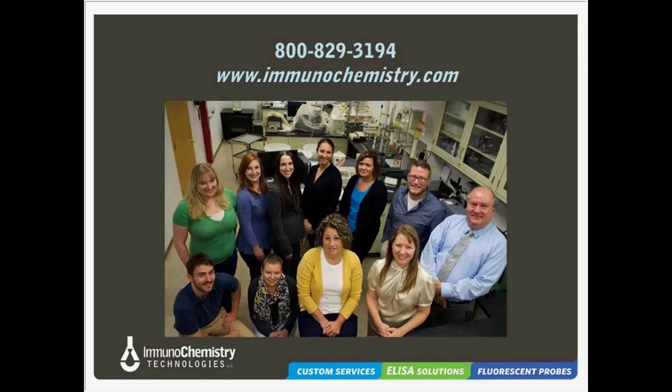You are going to need a longer capture time, meaning maybe 90 minutes, maybe 2 hours, in some cases 3 hours. You're going to take a longer period of time in order to capture a higher percentage of the analyte that's present.